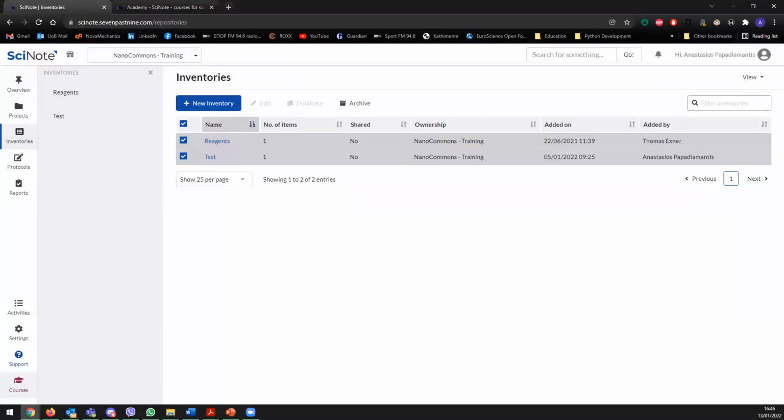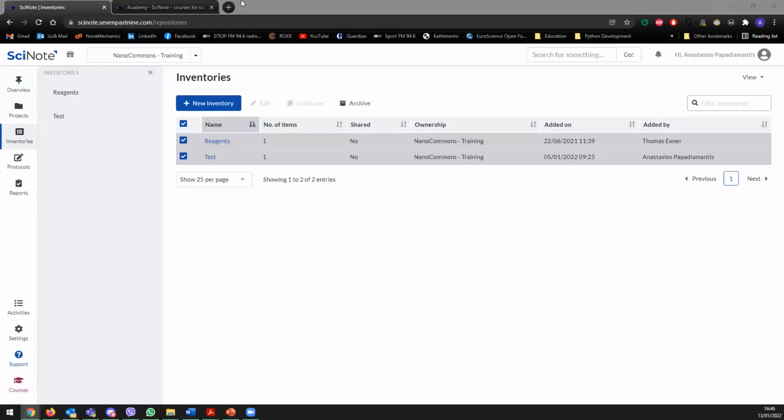Just very quickly from my side, I don't have much to say because Tassos really covered it very nicely. The only thing is, if you see on this training or NanoCommons version that there are some limitations, like you don't have enough space or it's too slow, please contact us, because we are running that on a very limited server at the moment.